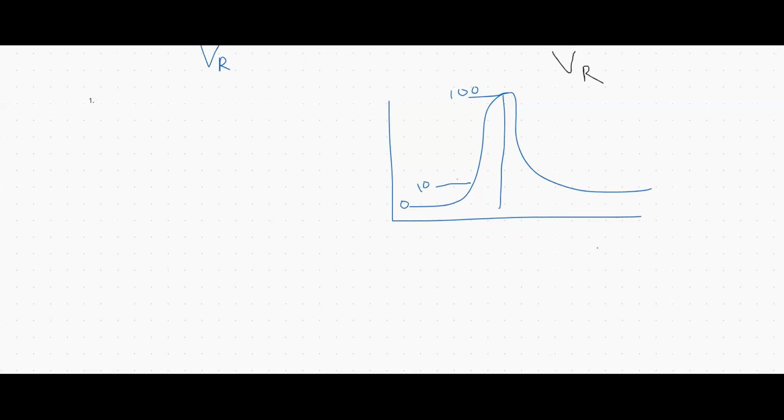It finds the width of the curve there, and that's how they calculate the asymmetry. So that's why you may see this called asymmetry 10%, because it's at 10% of the peak height. It's just the ratio of those two distances.